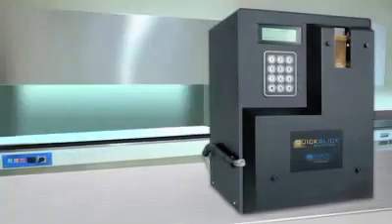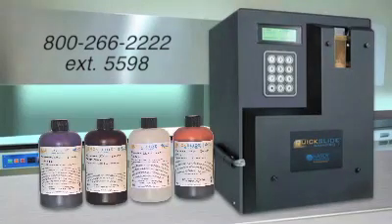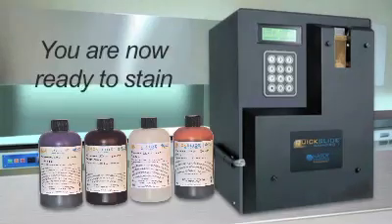Once you receive your instrument and stain kit, shipped separately, call our 1-800-TECH-SUPPORT line for any setup assistance. Following setup, you are now ready to stain.